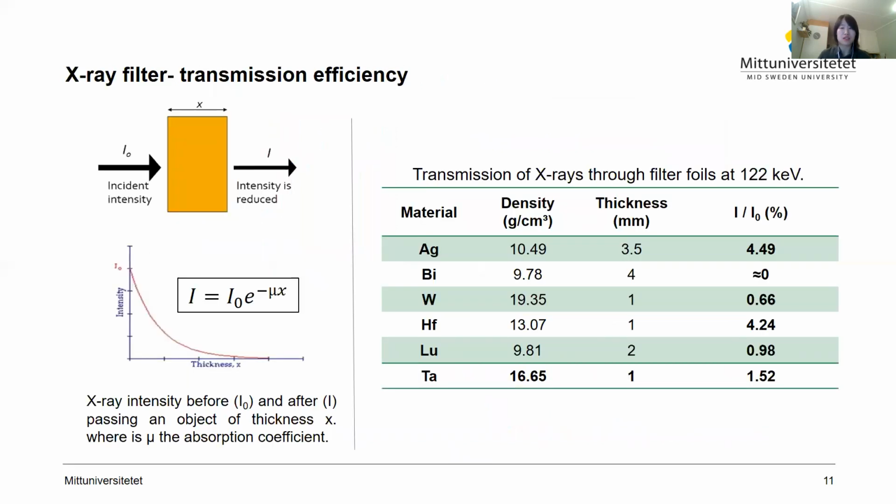Materials such as gas, wood, and rubber absorb relatively less X-rays. Conversely, even very thin sheets of heavy metals absorb nearly all X-rays incident upon them. Thus, by applying an X-ray filter, the intensity of the X-ray signal decreases as the thickness of the filter increases, and the measuring time is increased. So there is a trade-off between high sensitivity and short measurement time for a practical XRF setup.